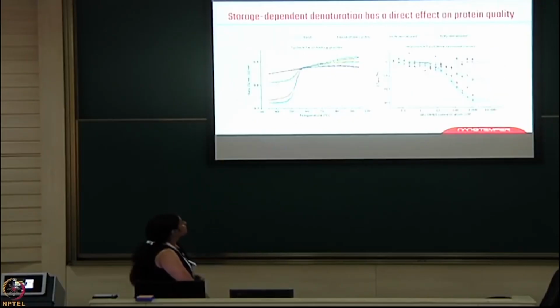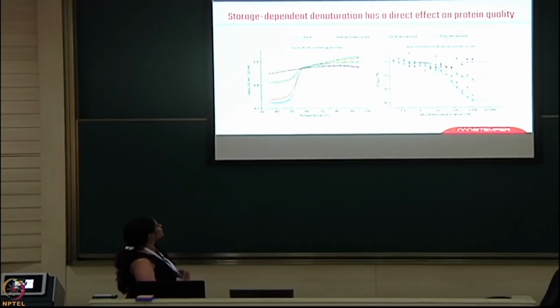And now, here is another example that we have conducted, where we have taken fresh samples, freeze-thaw cycle samples, and fully denatured and partially denatured samples. You can see how the trend has changed when you are checking the unfolding profiles. The fully denatured sample is giving you a very planar profile, whereas the partially denatured is giving a different profile compared to the freeze-thaw and the fresh samples.